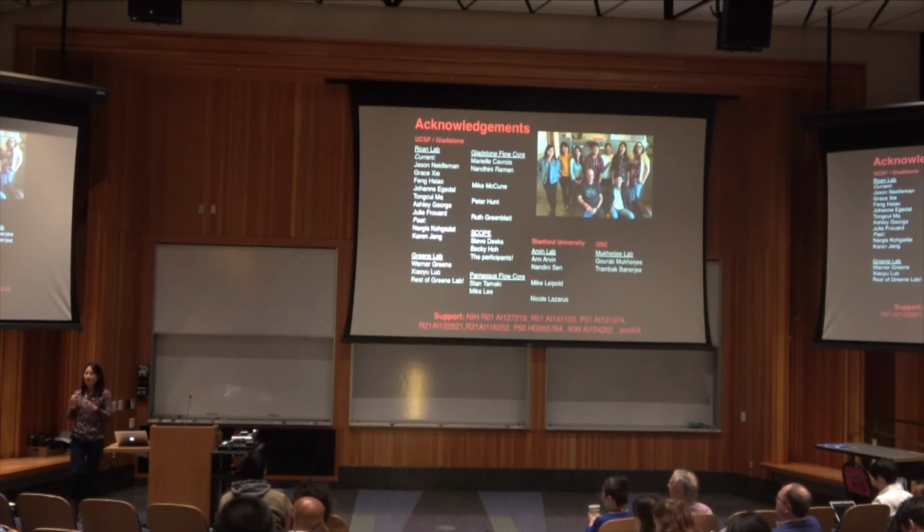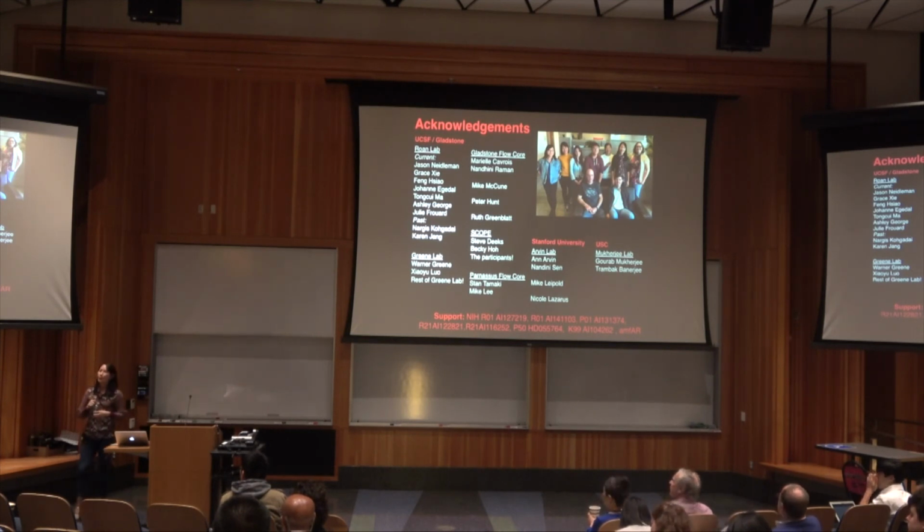I have one question. The PP slide seems like kind of magic. Can you tell us a little bit about it? Is that machine learning, or how does that work? This is really, really neat. Yeah, it's essentially a k-nearest neighbor approach. There's a particular equation that it uses, where we have 40 parameters that we've measured, that we've quantitated. And there's an equation it uses to identify, based on the k-nearest neighbor algorithm, the closest neighbor, if you will.